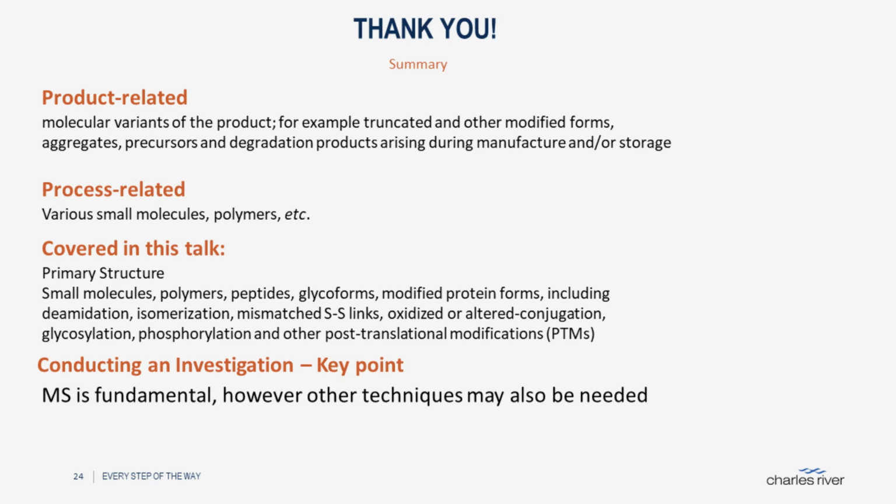Okay. And how do you recommend looking for E. coli HCP via LCMS since they lack glycosylation? Yeah, and so the example that I showed was just sort of one way to get some ideas about HCP present, but generally what we would do is if we're really going to conduct an HCP investigation is to start with the mock or null cell line material and characterize all those HCPs using a standard proteomics type of an approach. So once we have information about what's in that starting cell line, then those proteins can also be looked for throughout the downstream process.